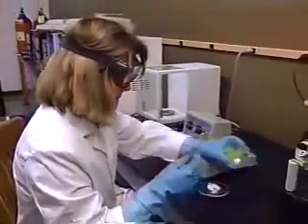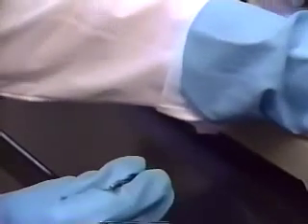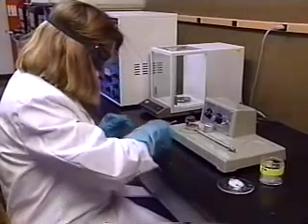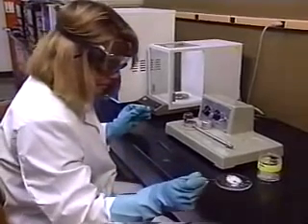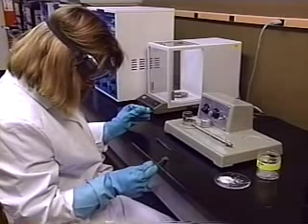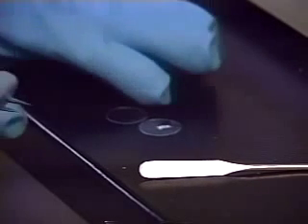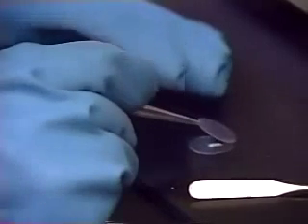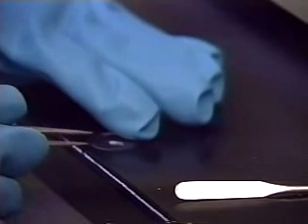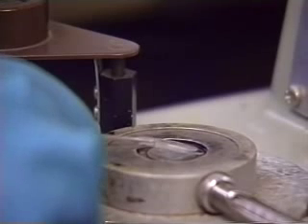To take a melting point, place a small amount of crystals between two cover slips. Place the cover slips on the hot plate of the apparatus.